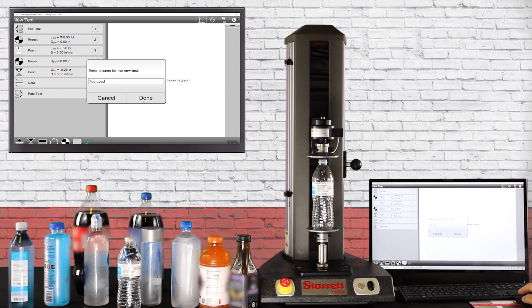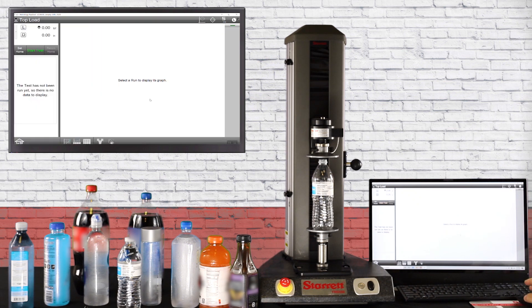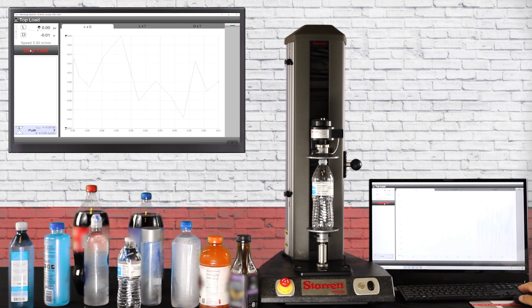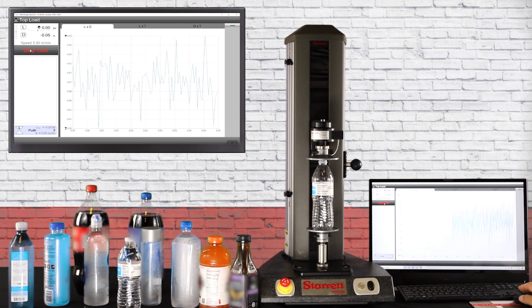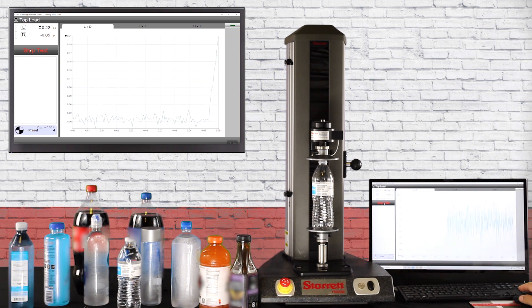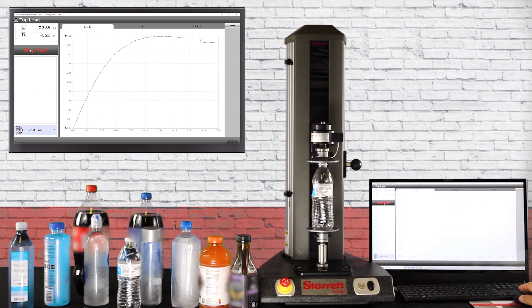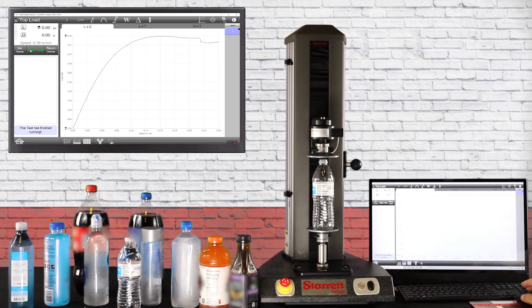Now let's go run our test. We hit start test. You can see the crosshead coming down, almost touches the top of the bottle, boom, there it touches it. There's our test. Come back up and there we go.